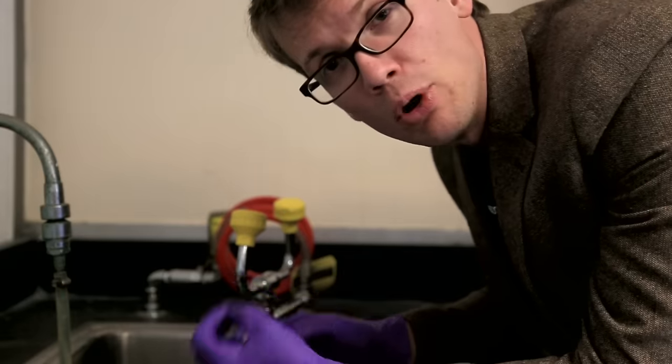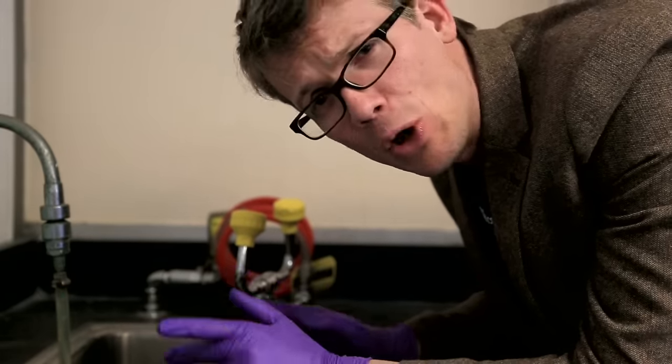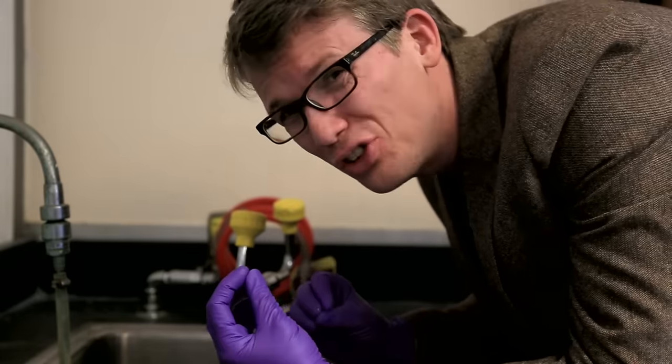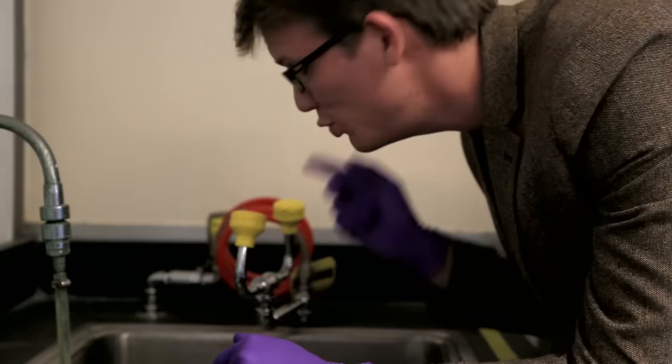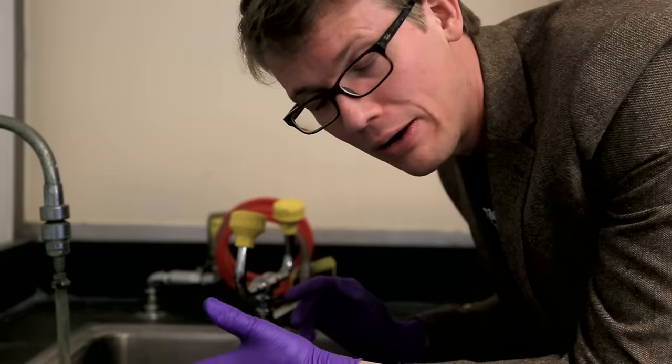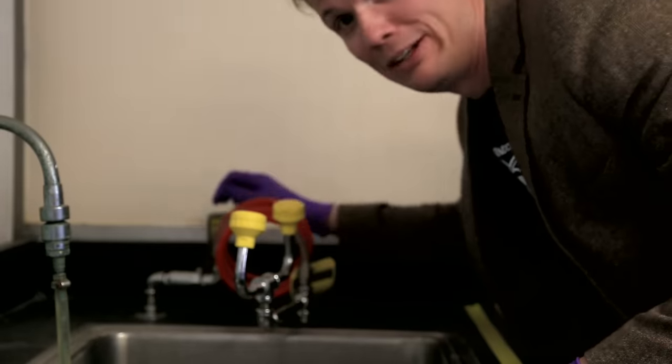Of course, your eyes are your most vulnerable organ. Always wear eye protection. And no, just glasses do not count. And if you feel like your eyes are starting to tingle or hurt, or even if you don't know how something might have gotten in there, use the eye wash. Because it never hurts to be careful and, you know, we've all wondered what it feels like. I've actually never done this, so this will be a new experience for me.